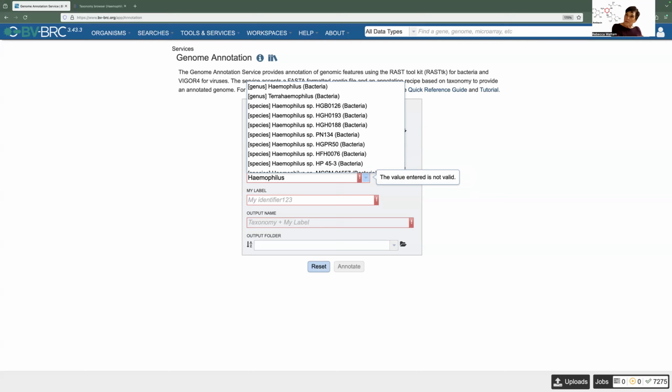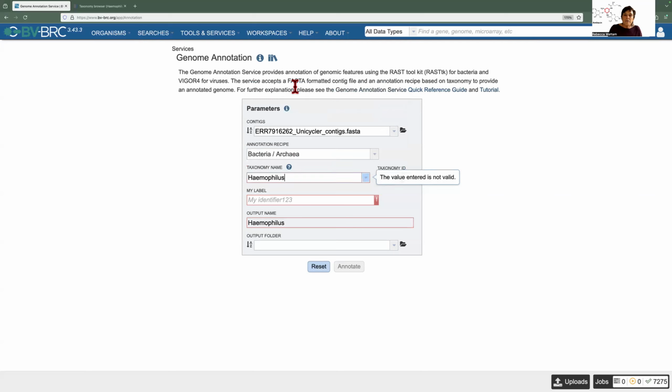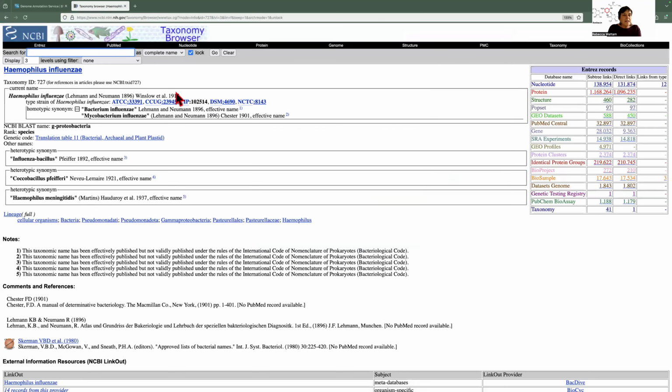And you also get the global protein families, which are the cross families. We call these the PLfams for the local or the genus specific, or the PGfams for the global or cross genus ones. So I could click on Haemophilus here, or you could click in the number too.